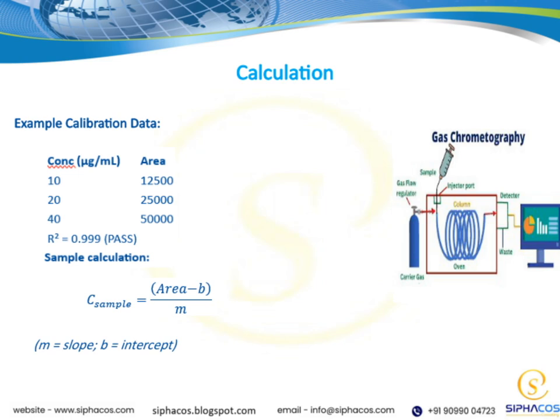In practical terms, we use these values to create a calibration curve that allows us to convert raw data into meaningful measurements. When we have our calibration data, we fit a line through the points, which gives us the slope and intercept.